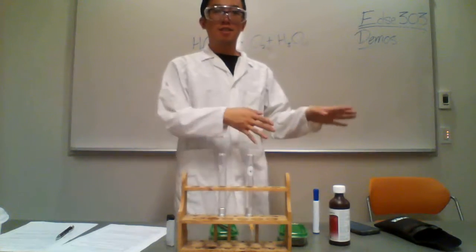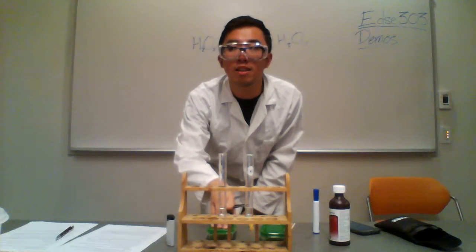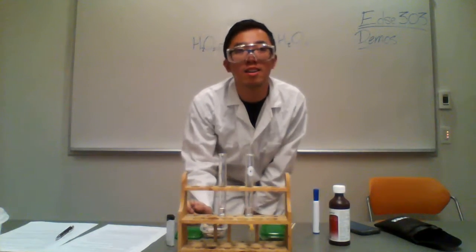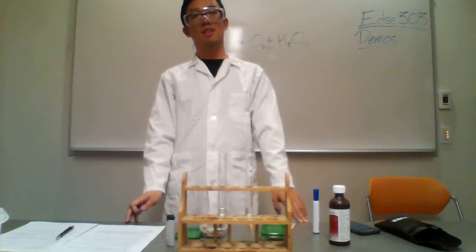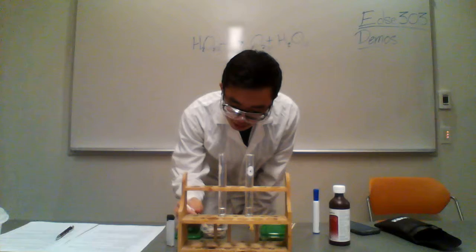So what do you guys think this reaction will look like? It'll be bubbling, so let's just get on with it. Do you think one will react differently from the other, like the potato compared to the liver? Yes. Why do you think one will react differently than the other? Because the liver will be mostly made up of proteins and the potato will be mostly made up of starches. That is true, but let's just see how that turns out.